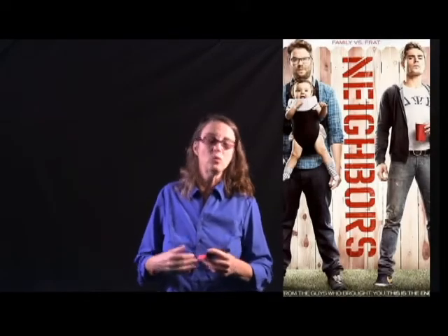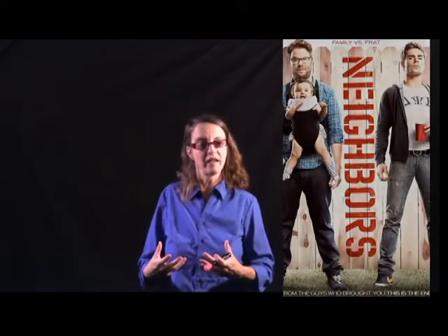Welcome to Chemistry Lab. Today's lab, intermolecular forces and colligative properties. The strength of intermolecular forces determines how strongly molecules are attracted to their neighbors, and that has a lot to do with what phase you tend to find certain substances in.